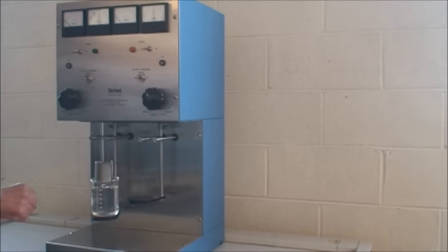As you can see, the platinum electrodes are nested one within the other with a glass stirring rod going through the center.